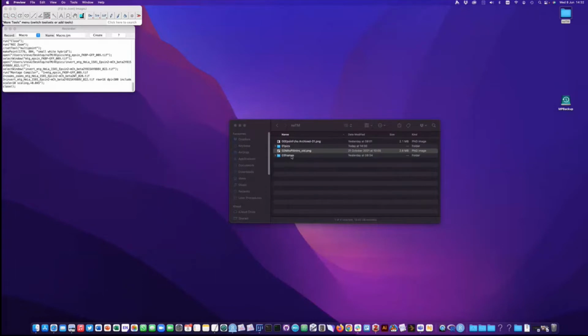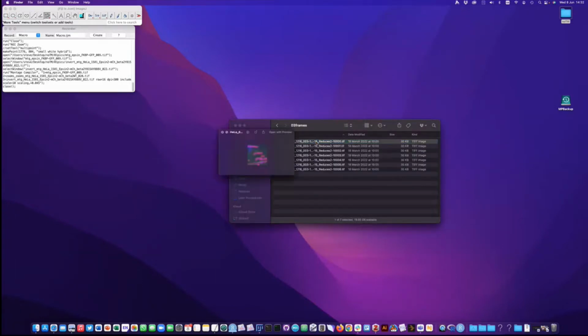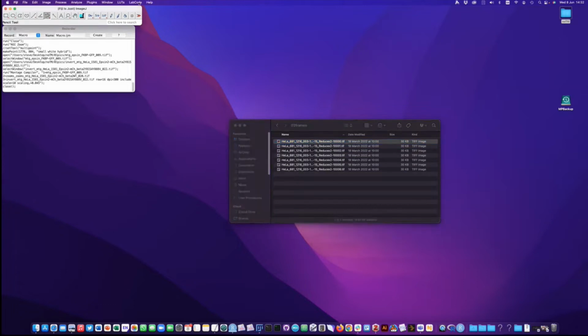We're now experts at all this, so I can go quickly through this, but I've got these already saved as distinct frames. So they've already been chopped, and what we do is we go to our make montage directory.